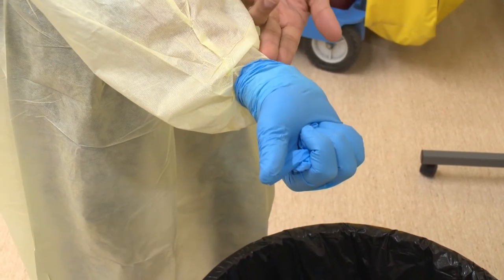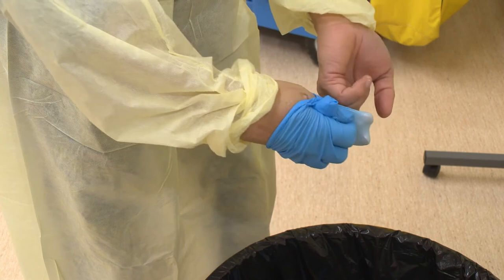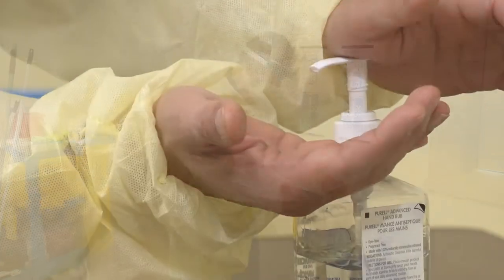Then, slide two ungloved fingers inside your other glove, making sure not to touch the outside of the glove, and peel it away. Put both gloves into the waste container and perform hand hygiene.